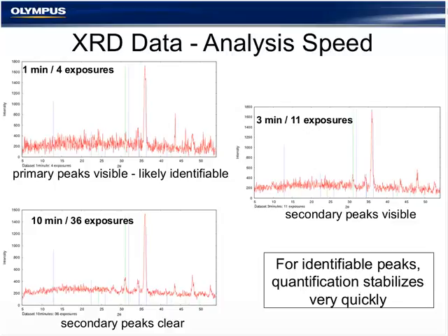Our customers typically are doing 5 to 10 minute tests, of course, depending on how much they care about quantification of the secondary peaks.